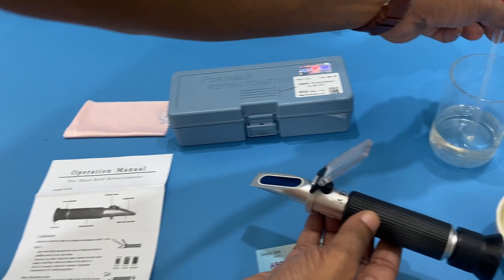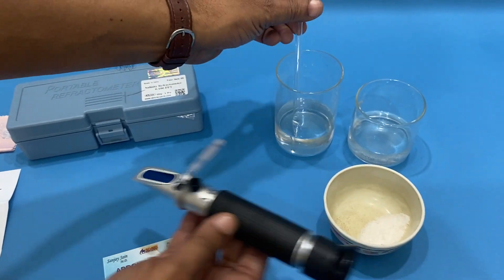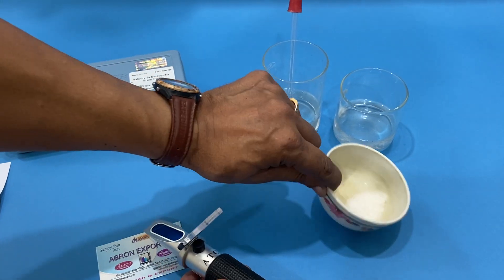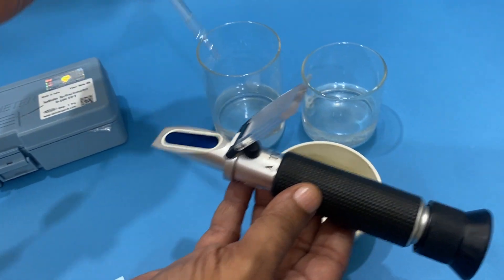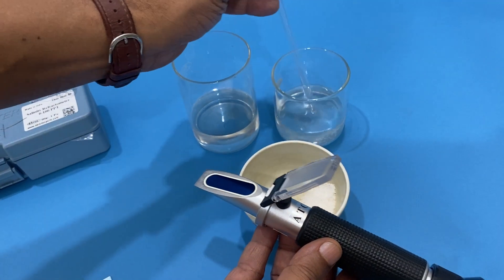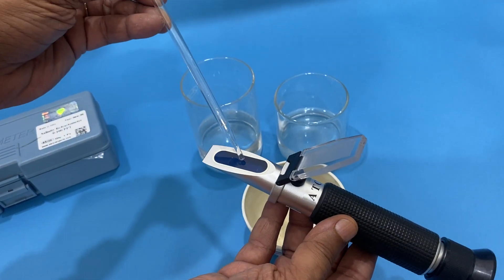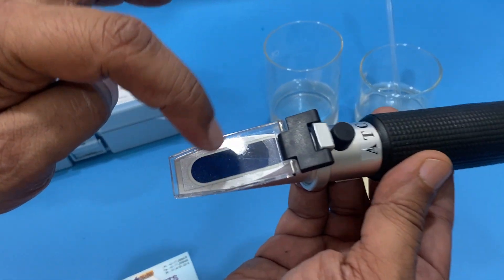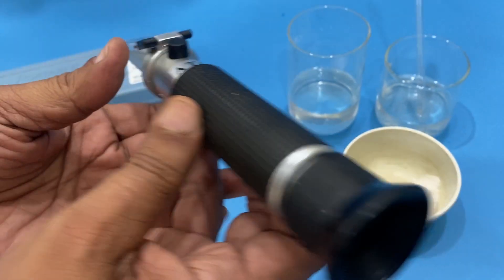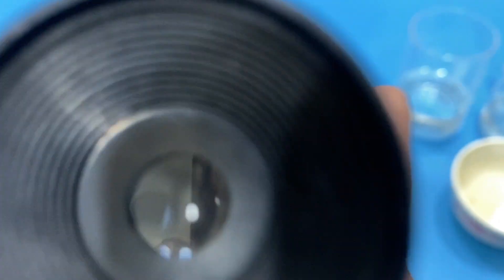I have prepared two solutions — one with less sodium chloride and one with a higher concentration. I put the salt solution here — just one drop — and then the higher concentration drop. I close the cover plate and it spreads across the surface. Now I will show you how it works on the scale.